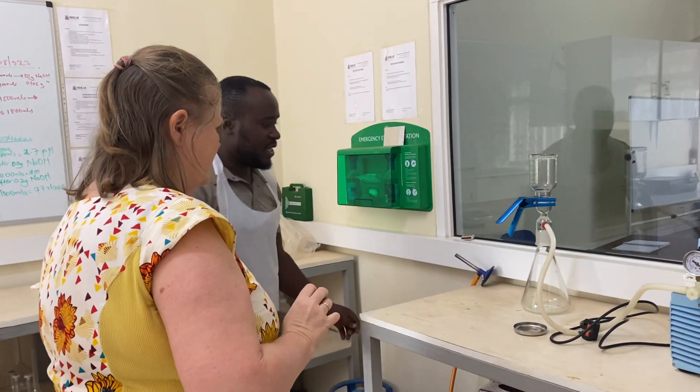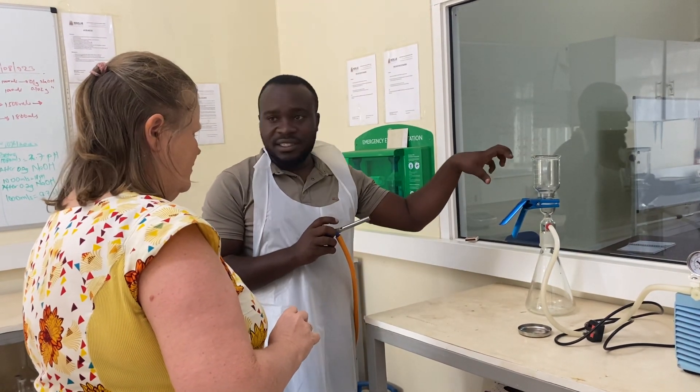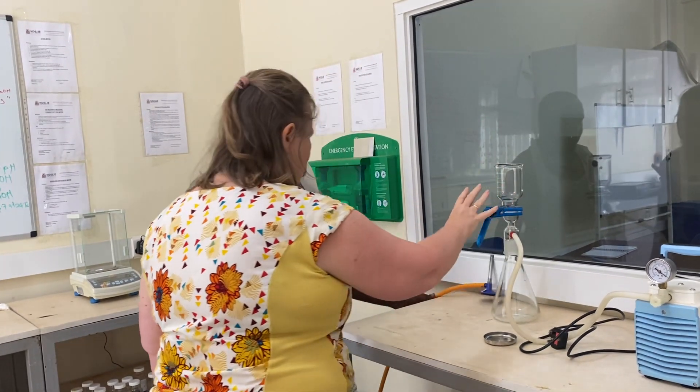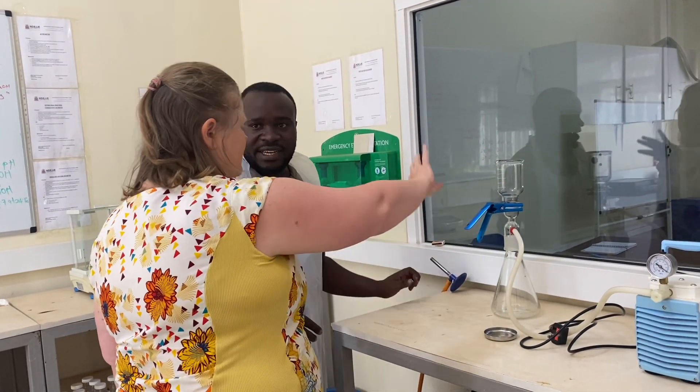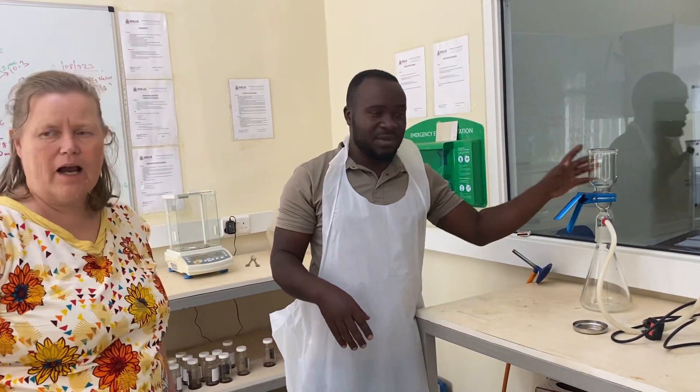So usually when we are working, we are using this to heat — for sterilization. First you preheat it, then you let it cool, then you assemble it together. Actually, we don't first use this. We first autoclave. I'm just assembling it. Autoclave.